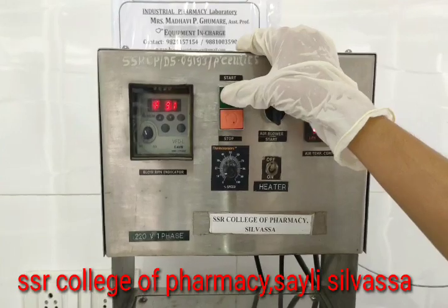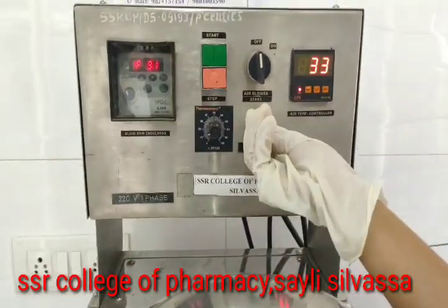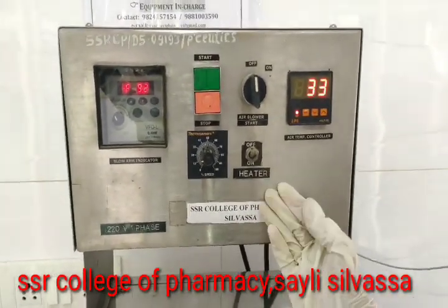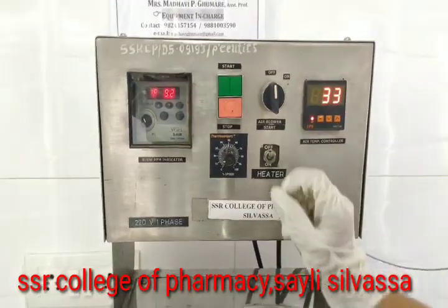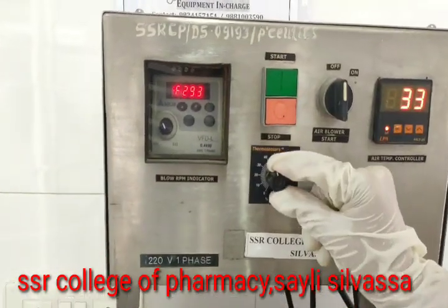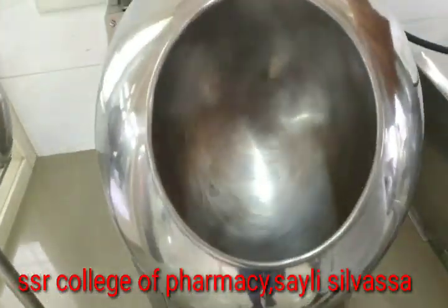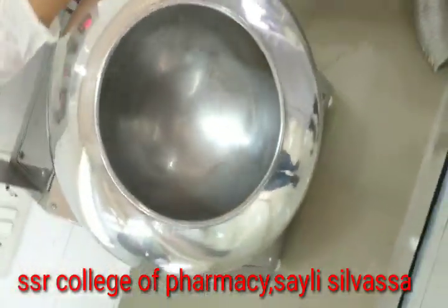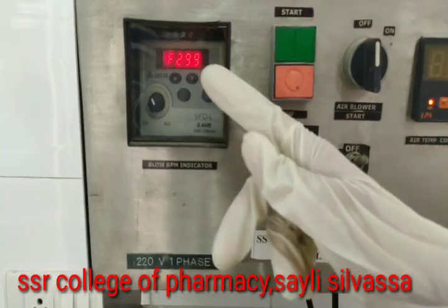This is the start and stop button for the equipment. This is the heater on/off button — the heater is currently off, and we can turn it on when needed. This is the speed rotator, which rotates the pan at the speed we set. This display indicates the blower RPM.